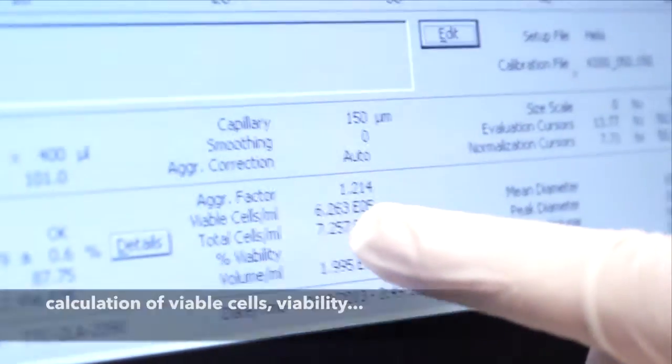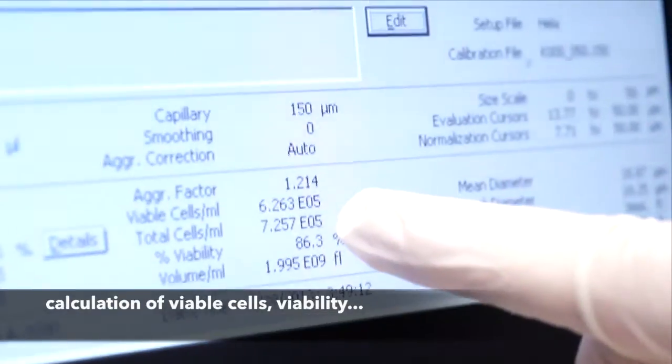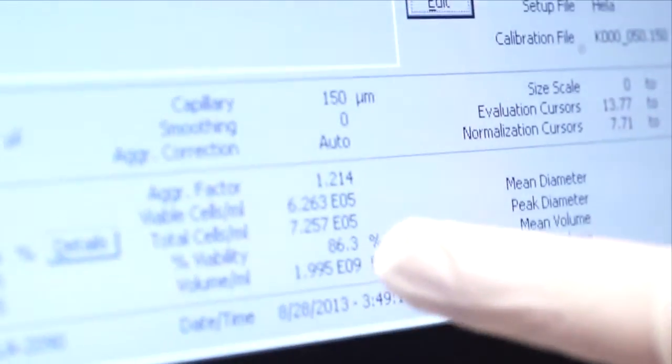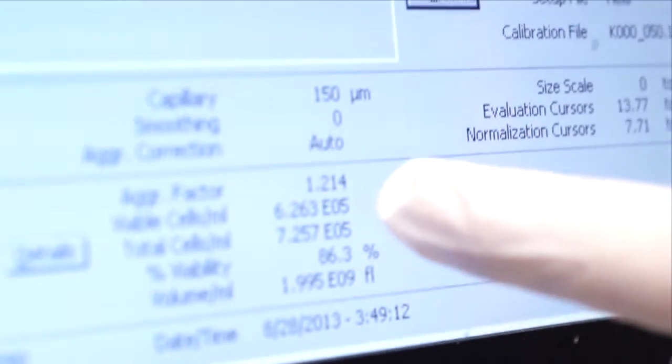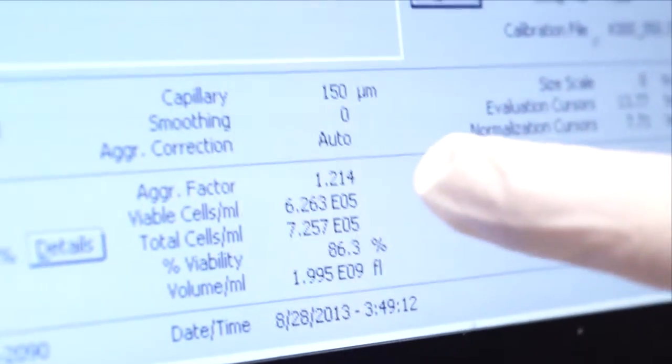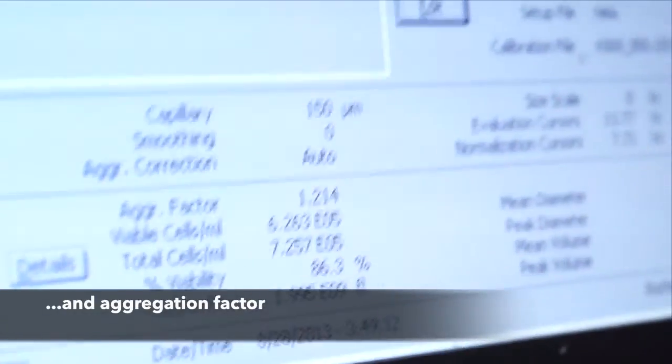From these results, the vital cell number is calculated to be 6.26 times 10 to the power of 5. This equals a vitality of 86.3% and an aggregation factor of 1.214.